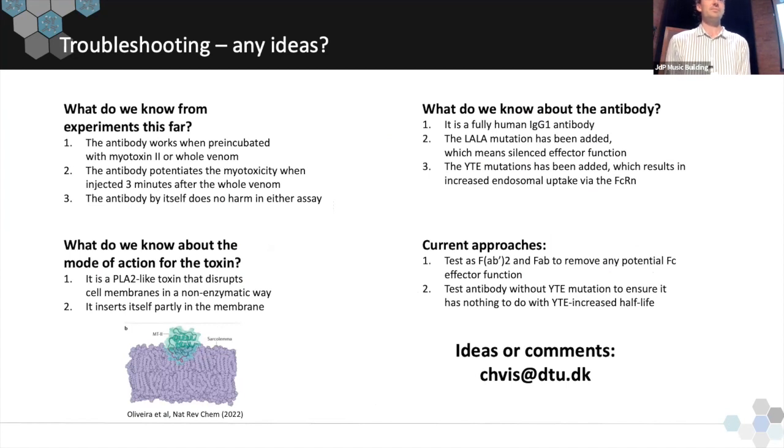Well, the comparison between the antivenom and the monoclonal is not so comparable, because you are working with a solution that contains perhaps 10% of the anti-myotoxin versus a pure monoclonal that is 100% homogeneous against the myotoxin. So there could be problems in the combination of those. But have you done competitive assays of the purified antitoxins from the antivenom and the monoclonal, to see if they are competing for the same epitope or for different epitopes?